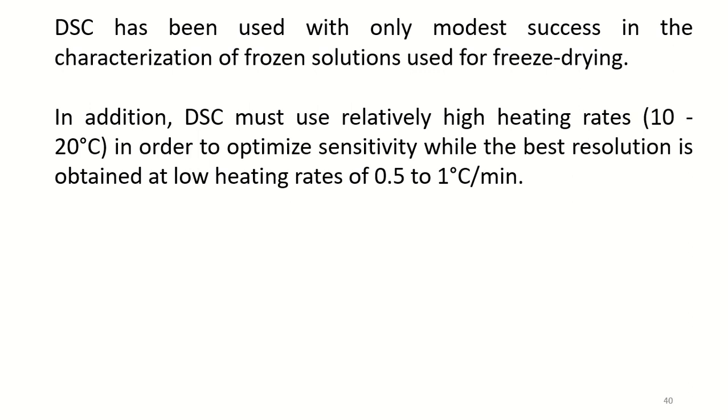DSC has been used with only modest success in characterization of frozen solutions used for freeze drying. The reason is that there are numerous components and transitions happening within a narrow temperature range, and differential scanning calorimetry can only measure the sum of these.